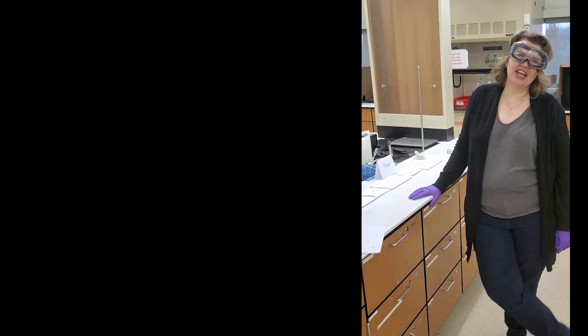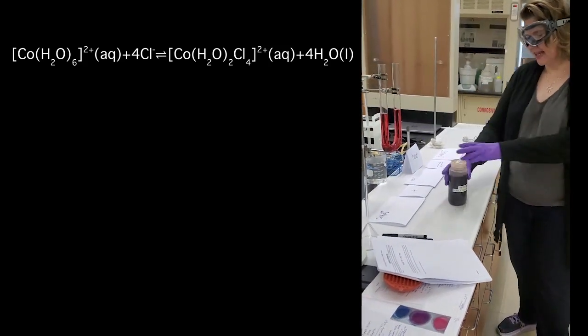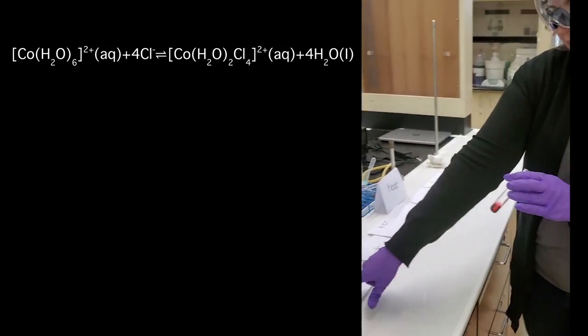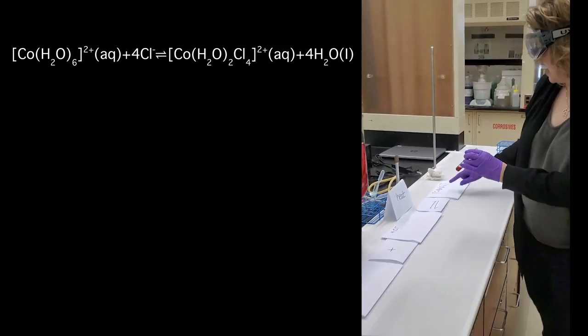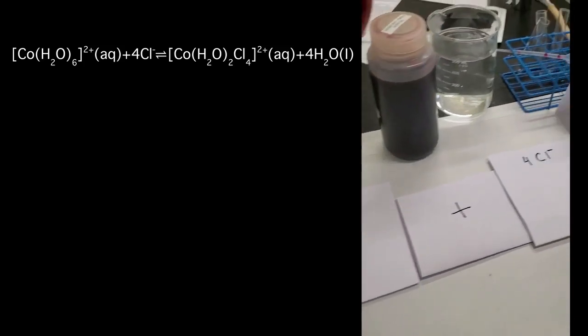Our final Le Chatelier's Principle system we're going to look at is cobalt with cobalt chloride. Here I already have a solution of cobalt chloride that's diluted for us to take a look at. Some students say this is a raspberry or burgundy color. Right now we have a combination — this is cobalt chloride — a mixture of the cobalt hexahydrate and the cobalt that has four chlorines in it, and it's a mixture of these colors.